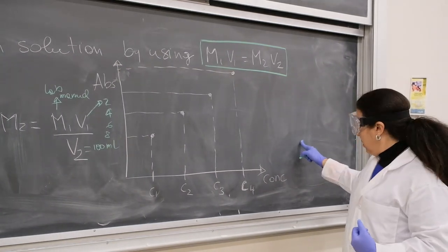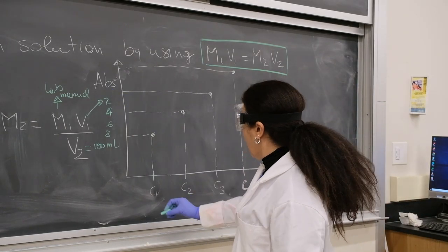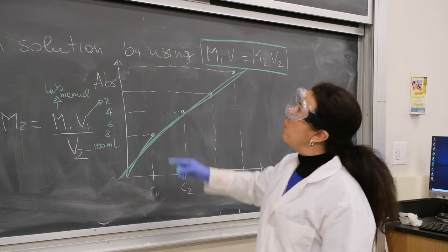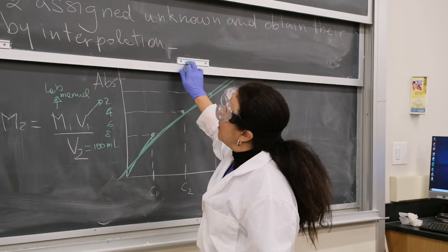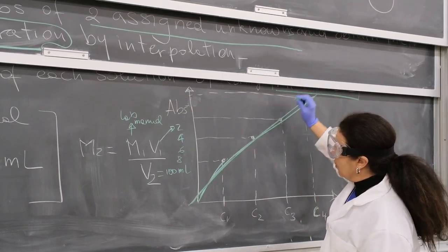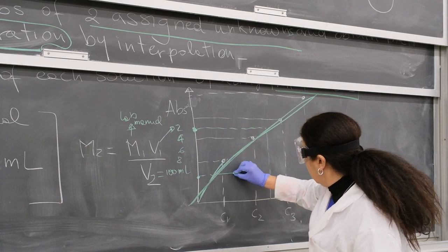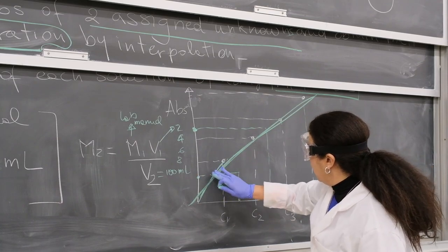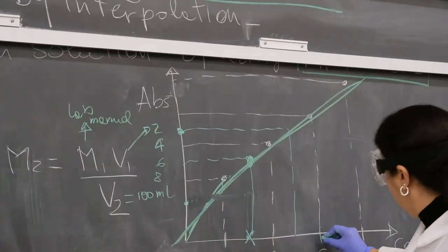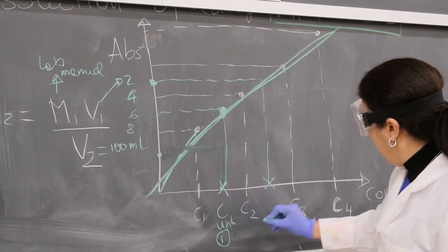You find a curve in which you have the concentration of the Allura red in the four containers versus the absorbance. You will create a best fit line, and then when you measure the absorbance of the two assigned unknown solutions, you will obtain from the absorbance, let's see, one is here, for example, and one is here. Okay, from these values here, one and two, you obtain the concentration of unknown one and unknown two.